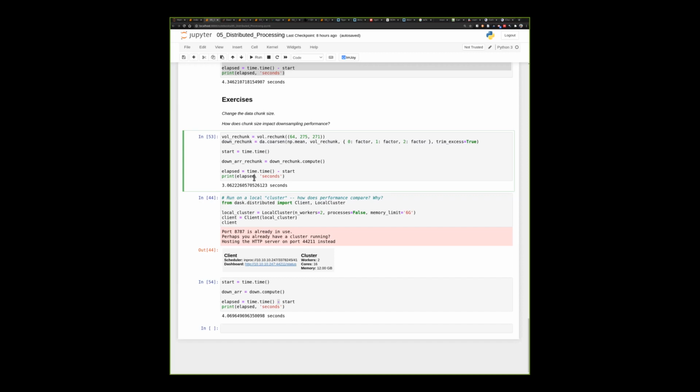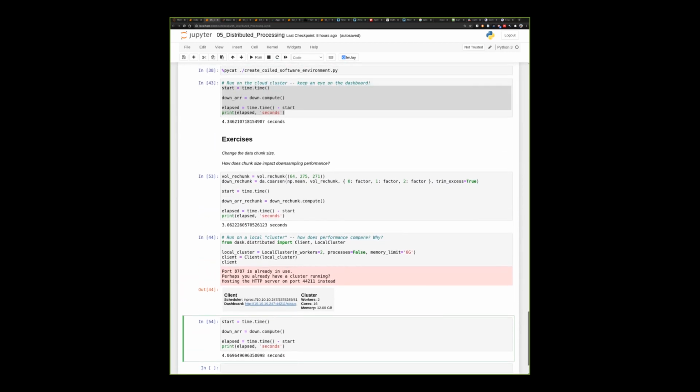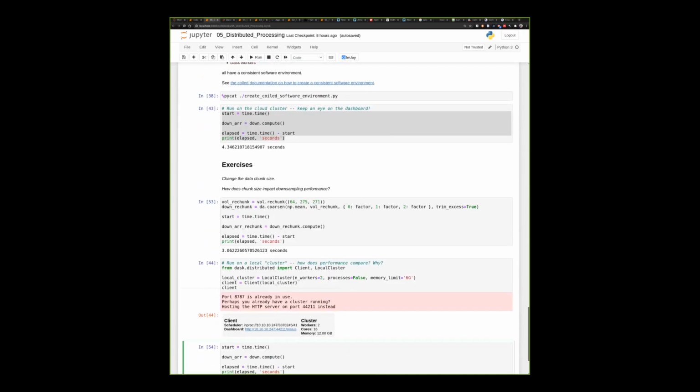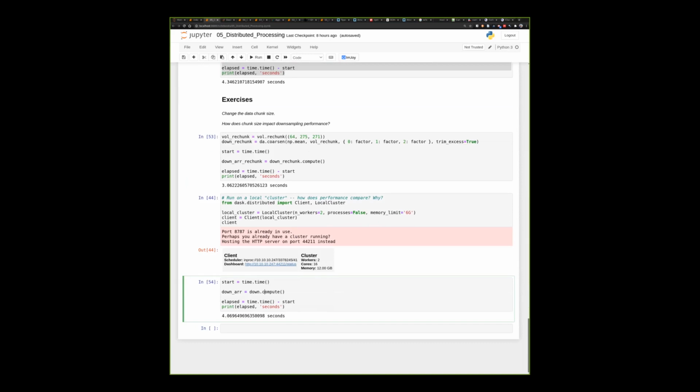It was faster with larger chunks versus the default chunk size of how the data was stored on disk, which is common. So a strategy you often want to use is as large a chunk size as possible without running out of memory or hitting the workers' communication timeouts. That reduces the overhead of scheduling and network transfer of the data.